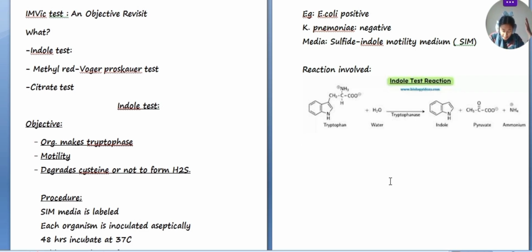Hydrogen sulfide is formed by anaerobic respiration. In putrefaction, a sulfur-containing amino acid like cysteine is broken down by the enzyme cysteinase. This produces pyruvic acid, ammonia, and hydrogen sulfide. Now let's talk about the discussion and conclusion.